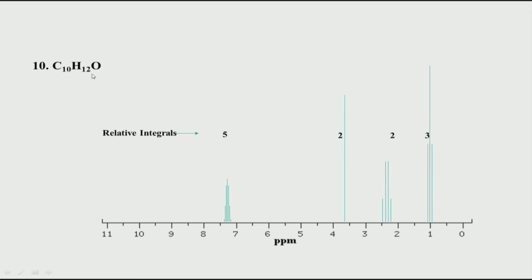But now there is an oxygen group here, which earlier was not there, and that probably is causing this downfield shift. So, what is happening is that there is a CH2 because there is a 2 now, this is not a methyl. So, there is an isolated CH2 which is attached to an oxygen. That is what is interesting, that there is an isolated group, and in this particular case here, you see a triplet and a quartet.